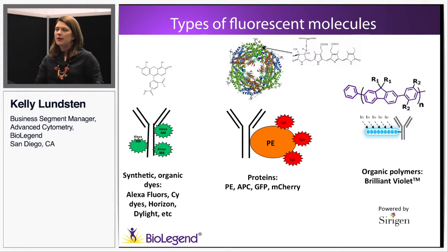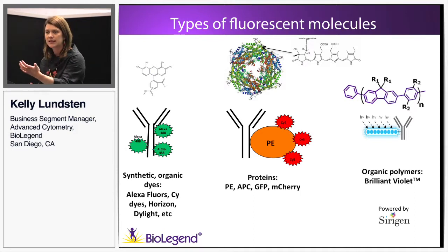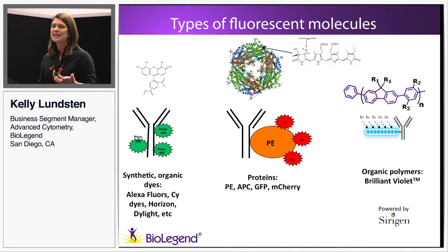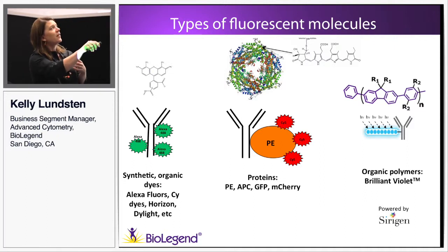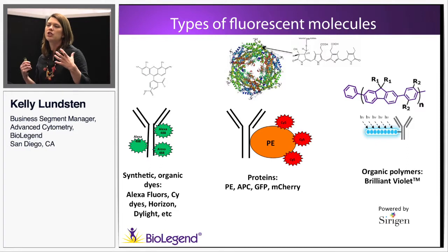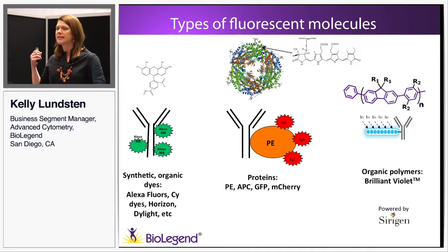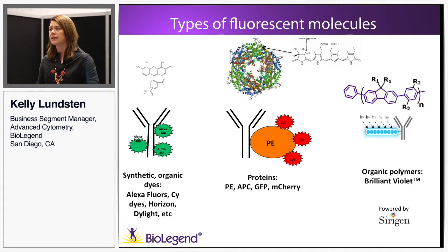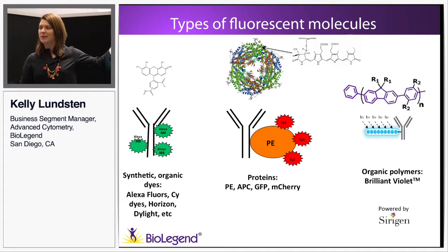That's why we've come to rely so heavily on PE and APC, different proteins. GFP, obviously, was quite revolutionary because it would always tell me I had one protein to one fluorescent signal. But PE is 240 kilodaltons, the majority of which is non-fluorescent protein. It's a matrix holding the chromophore in place so that the fluor can be rigid. The phycobilin structure can be held rigid by that matrix in order to become fluorescent. That's why PE is so sensitive to its environment. The minute I denature that protein scaffolding, if I hurt it whatsoever, the entire 3D matrix of that PE will fall apart, quenching all of the chromophores embedded inside it. So it has a large powerhouse of potential, unless I look at it wrong, in which case it's going to fall apart on me.